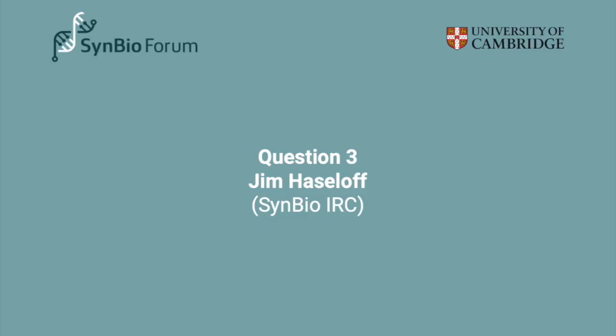I have a question also about the nature of the FRET pairs. And clearly for some applications, I think both of you touched on it in a way, some of the issues are the cost of the light sources and the arrangement of the microscope. And there are some relatively cheaper versus more expensive sources for lasers and LEDs. And clearly if you move towards a blue laser and there are various lower cost green and other lasers, could you recommend or see a way towards, say, optimized FRET sensors for low cost light sources, whether you knew of any work in that area or the likelihood of that? Maybe Jim and Dorus, you probably have a different view on that.